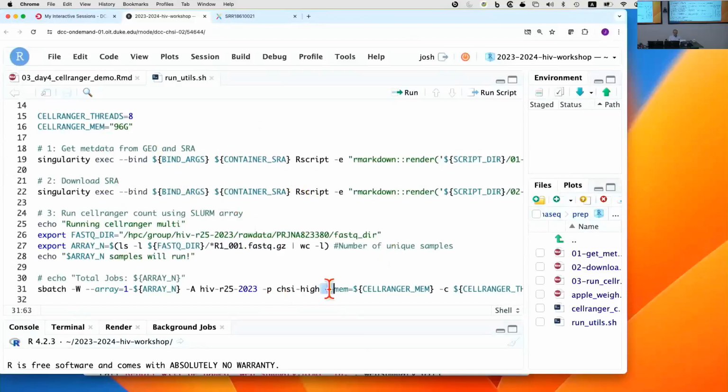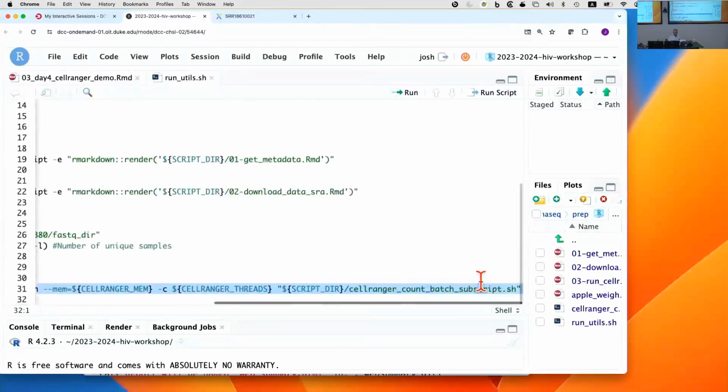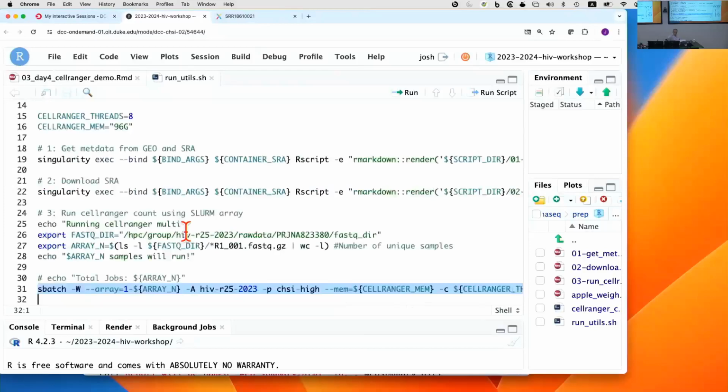There are some details here, and actually here it's even downloading the raw data before it does that. This is the business end where it's actually running another script that runs the R markdown on each of the separate samples. So it makes it faster. Oftentimes I don't bother to do this because I'm not really in that much of a hurry. For this data set, we probably could have gotten away with not doing that, but it does make it a little faster. That's the 9,000 foot view.